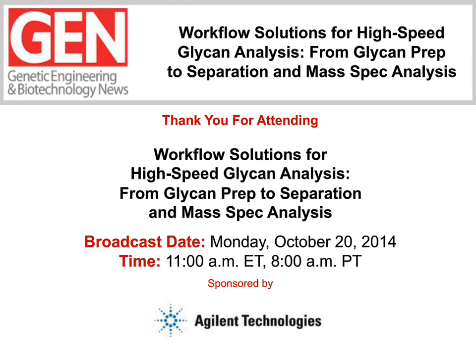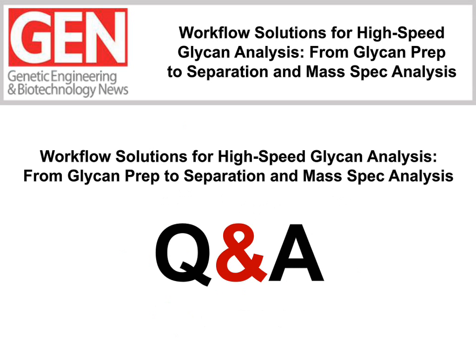Okay, let's begin the Q&A, and we'll take a look at the first question from our audience. Oscar, first question is for you. Can we use those HILIC columns for determination of alpha and beta glucans, not glycoproteins?